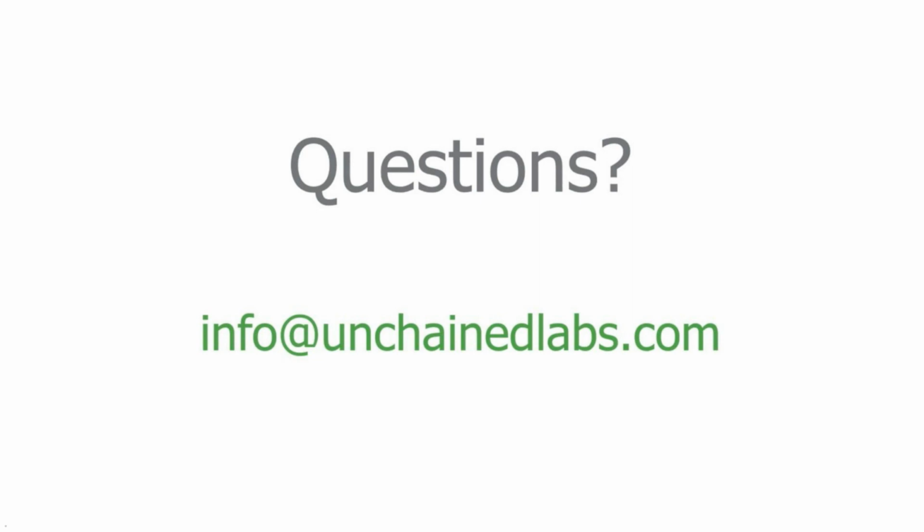All right, and it looks like we have time for one more question here. And this last question asks, does this work with self-complementary AAV? Yes, definitely. And that's actually one of the really interesting parameters that you can test out and see how it impacts capsid stability. So I know generally you're going to pick your genome based on its functional performance, but having a self-complementary AAV versus a single-stranded AAV genome will impact stability, will change genome ejection temperature.